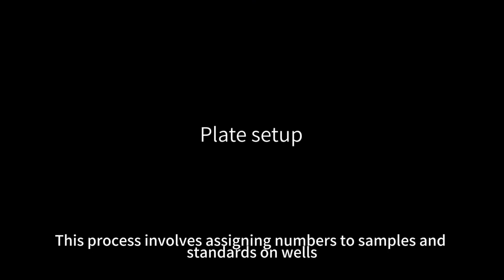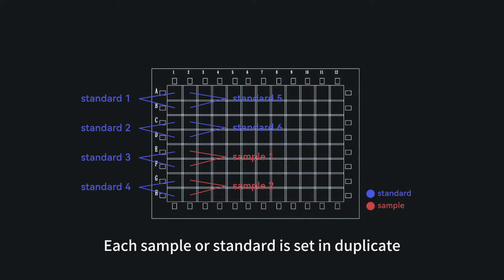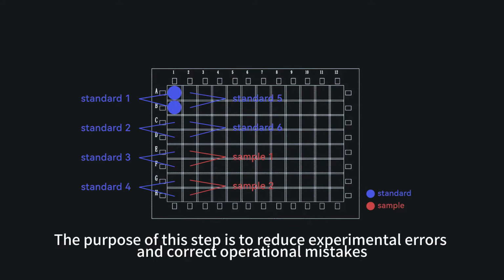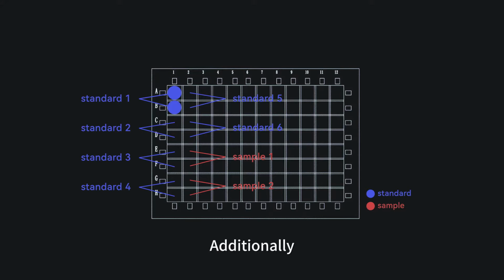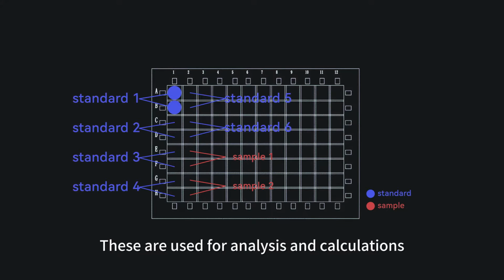Plate setup. This process involves assigning numbers to samples and standards on wells. Each sample or standard is set in duplicate, meaning each into separate wells. The purpose of this step is to reduce experimental errors and correct operational mistakes. Additionally, it's important to note that parallel experiments must be conducted for all 6 standards each time. These are used for analysis and calculations.